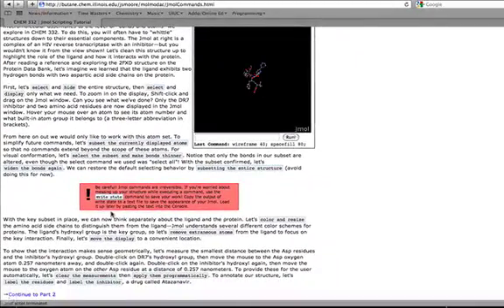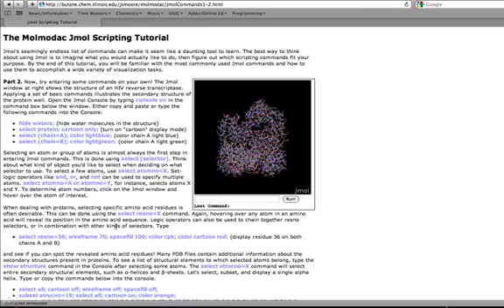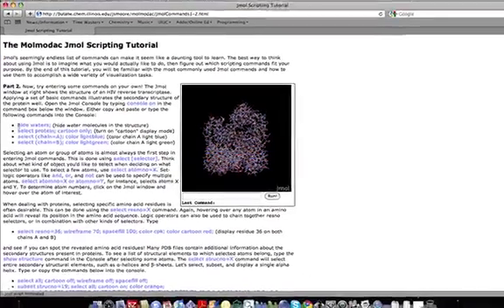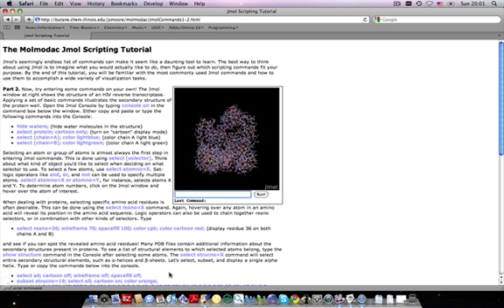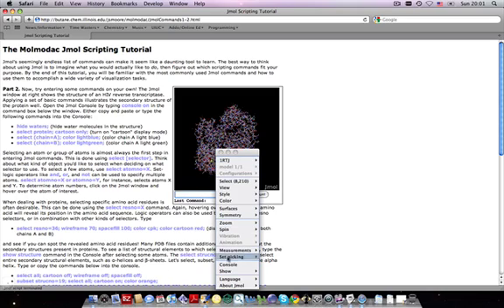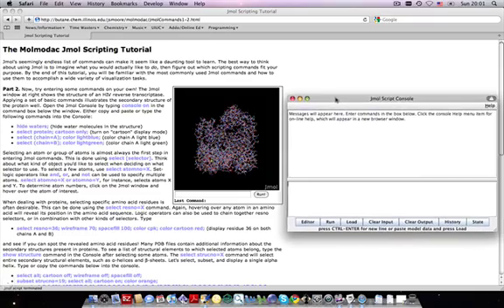Once you get done with part one, continuing on to part two, you'll see that part two relies on you to actually type in commands yourself. Anything you see in light blue in the text is a command that's meant to be typed into the JML console. You can either type commands into this prompt here, or you can right-click and select console to bring up a more traditional JML script console.